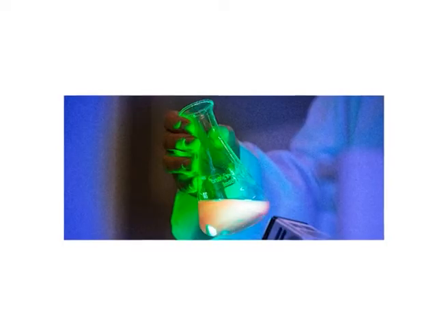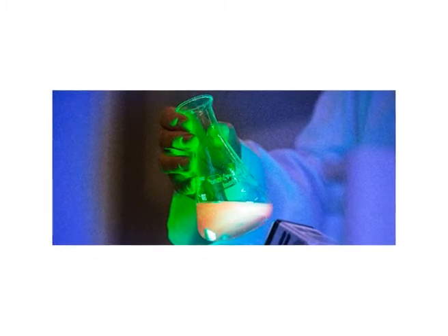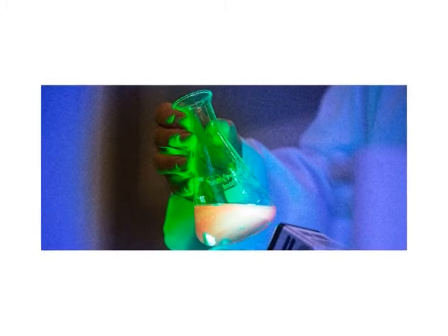content of sweat deposition. However, while the reaction of amino acids with ninhydrin yields a non-fluorescent product, the corresponding reaction with DFO gives a luminescent derivative. The fluorescent nature of the amino acid DFO reaction product helps in developing weak chance prints that are often encountered at crime scenes. It also assists in detecting fingerprints on multicolored and glossy papers. The figure here shows one half of a representative sample fingerprint developed on paper with the aid of DFO reagent.